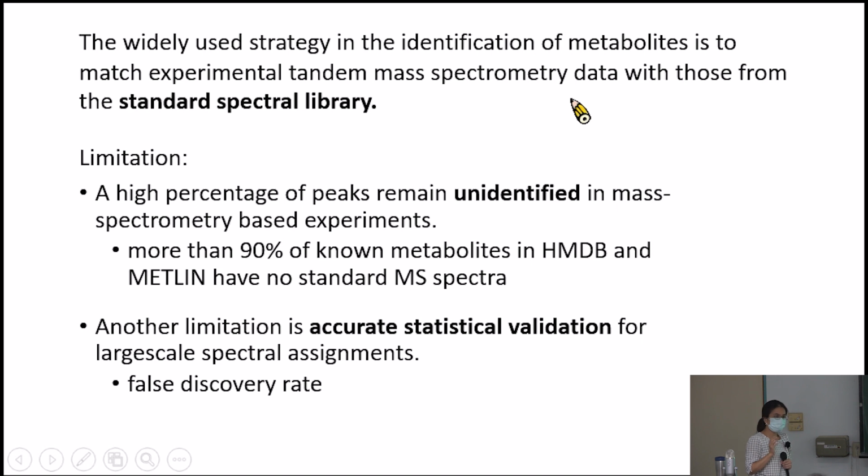The well-known libraries in this metabolic field are HMDB and METLIN, these two libraries. These two libraries basically can provide us some useful information for metabolomic analysis.